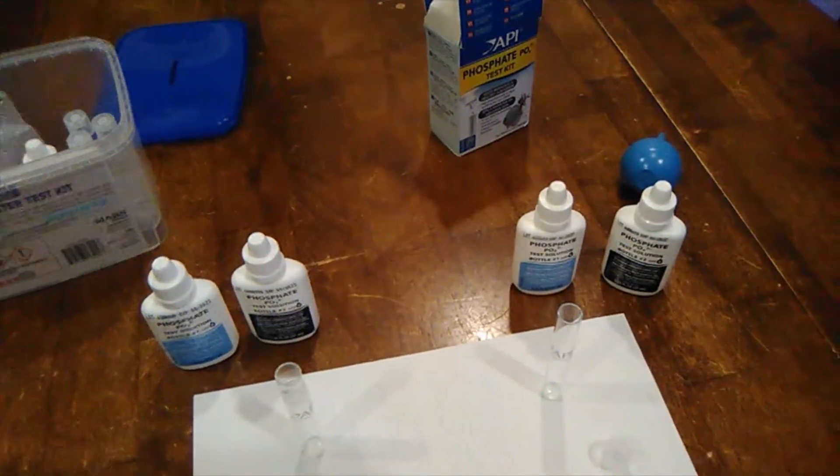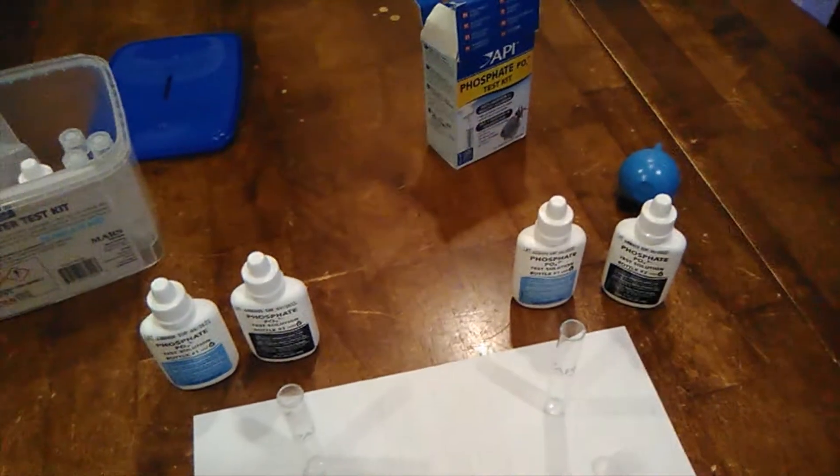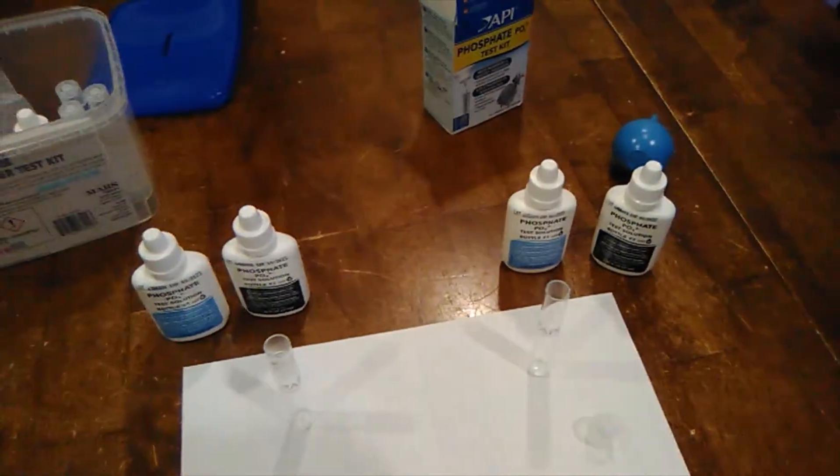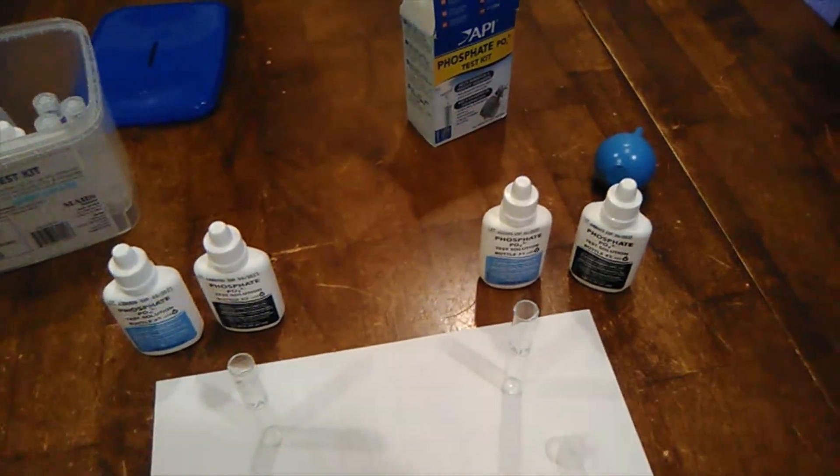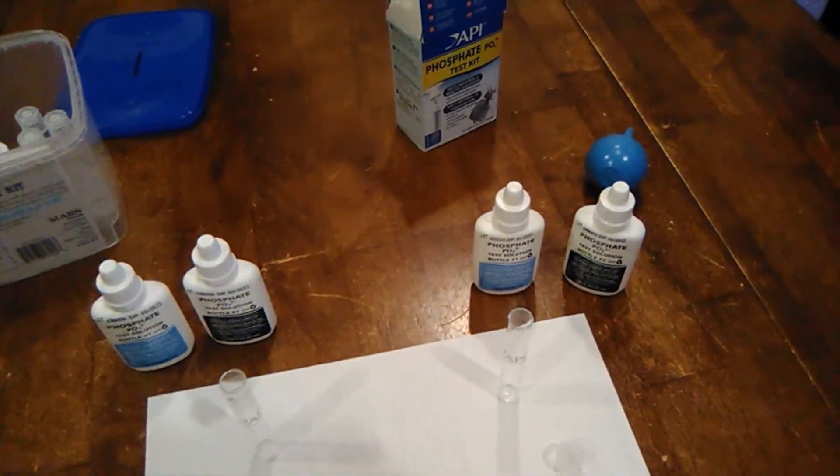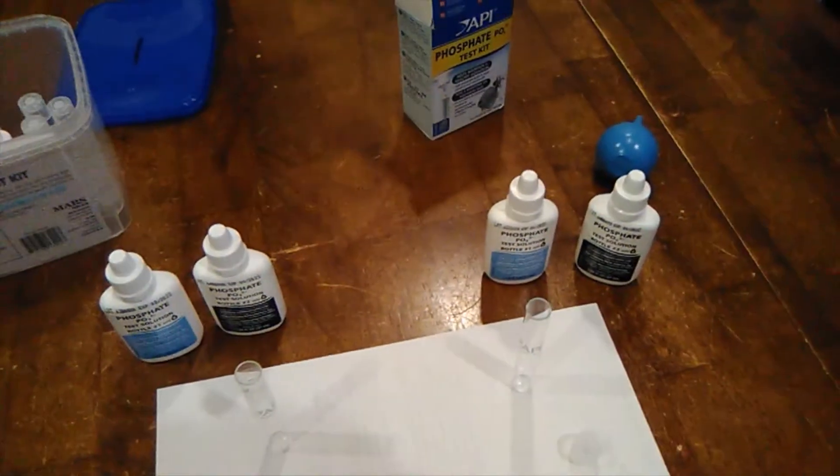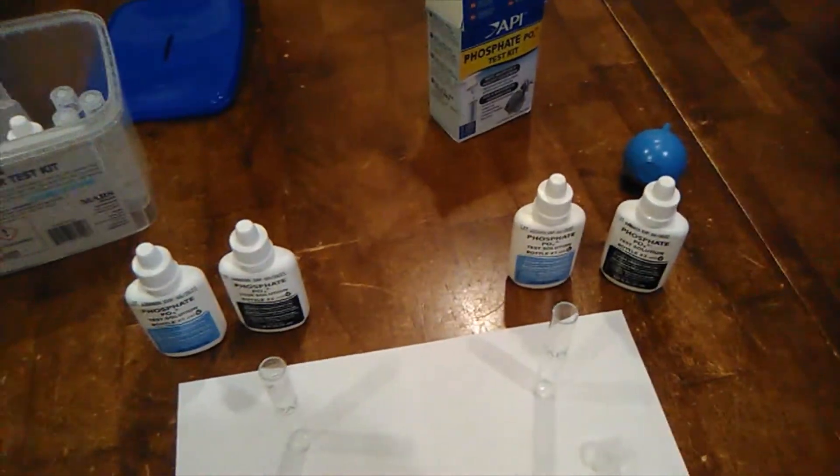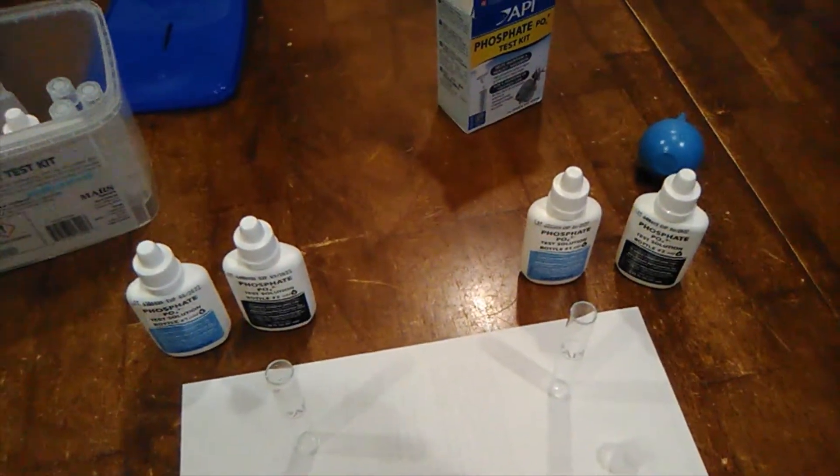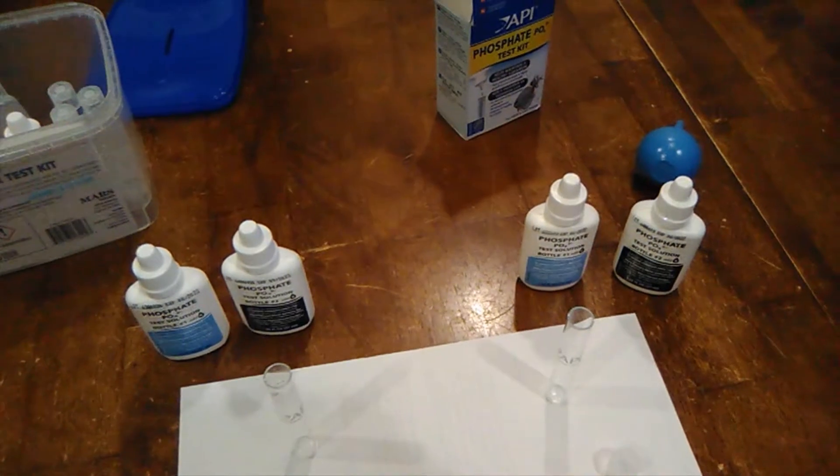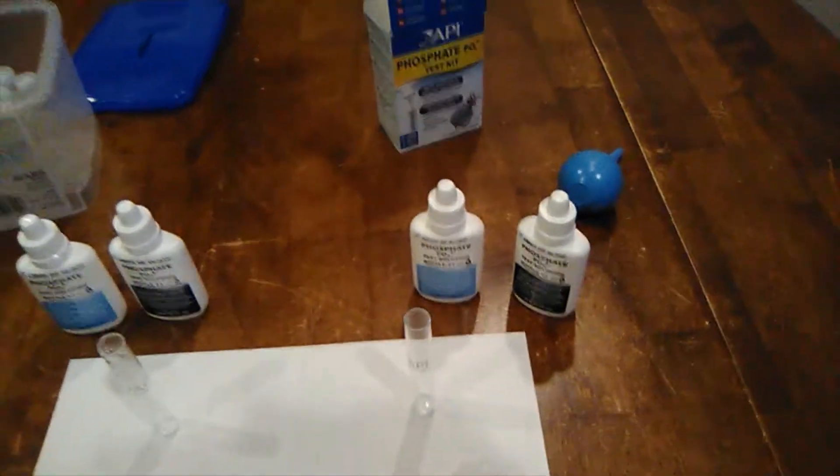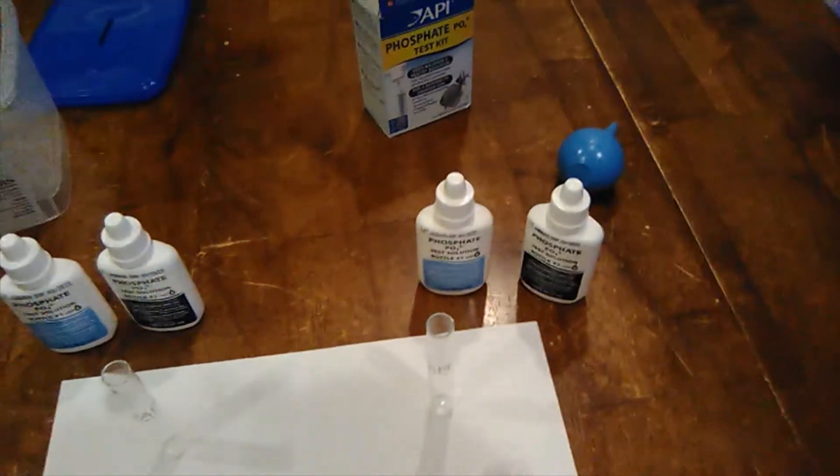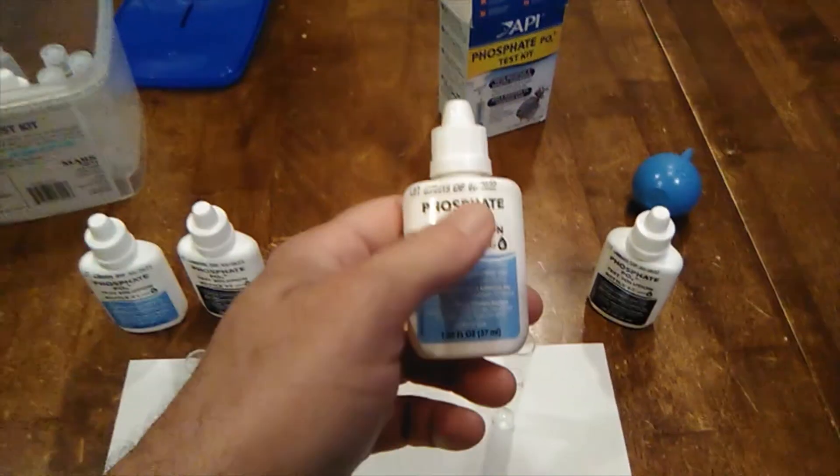Hi guys, I want to show you something unbelievable. I can't talk too loud because everyone else is still sleeping. This is my phosphate test kit from API, and I buy API because I'm cheap. This one is getting ready to run out and has an expiration date of 6/22.